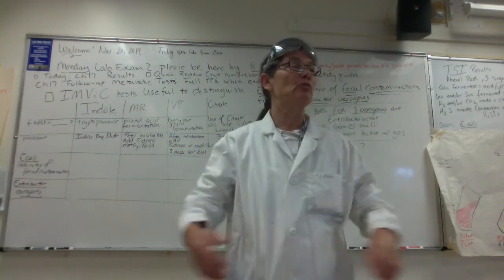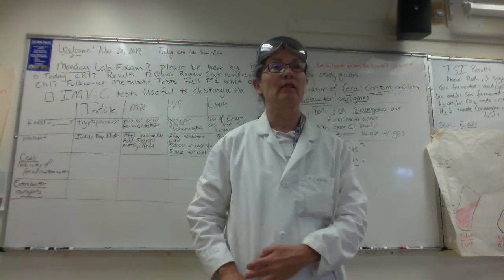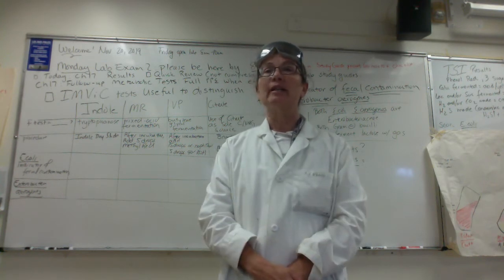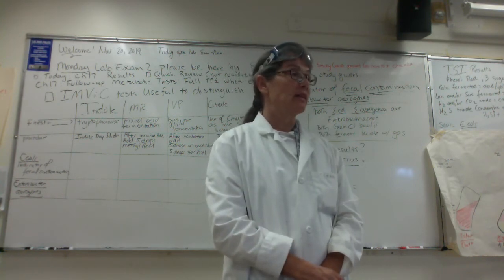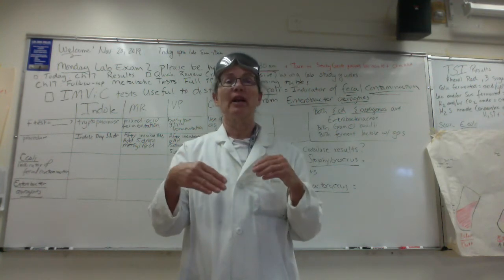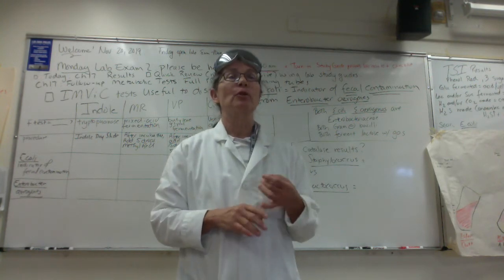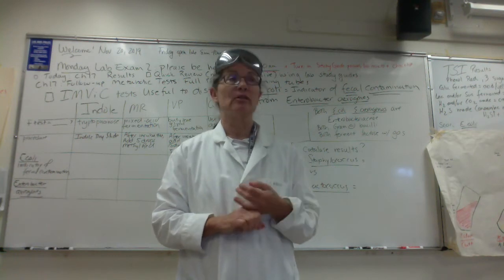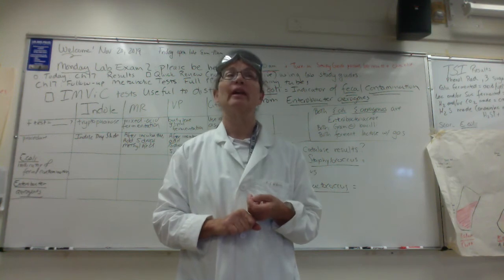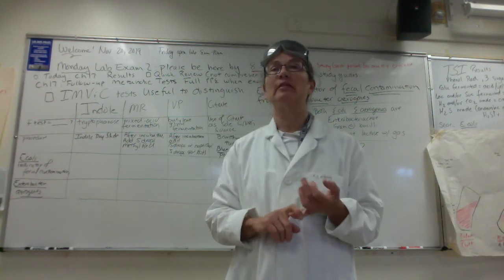And you guys, how did you run the indol test? How did you do that on Monday? Do you remember how you ran it? The dry slide, right? Exactly, you guys. Remember, it's nice, quick, fast, benchtop test. So folks, if your microbe made indol, what color did the dry slide reagents turn? Red, good. So remember that. Red's a positive indol test.